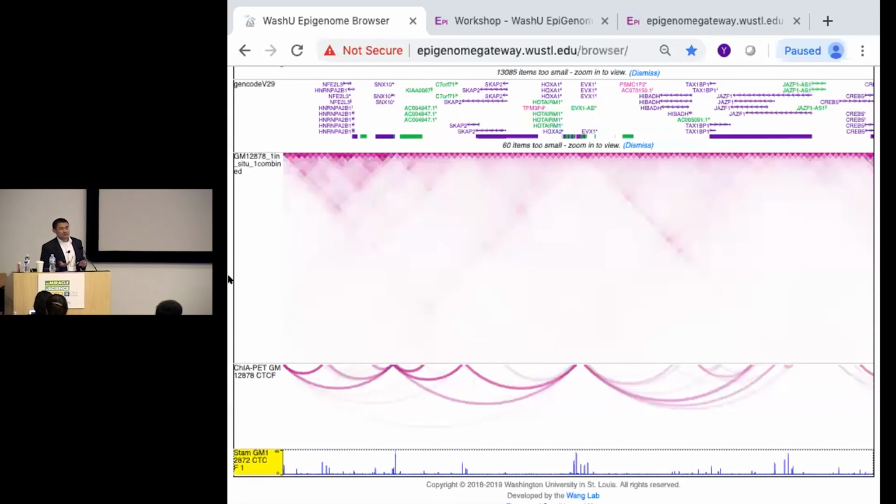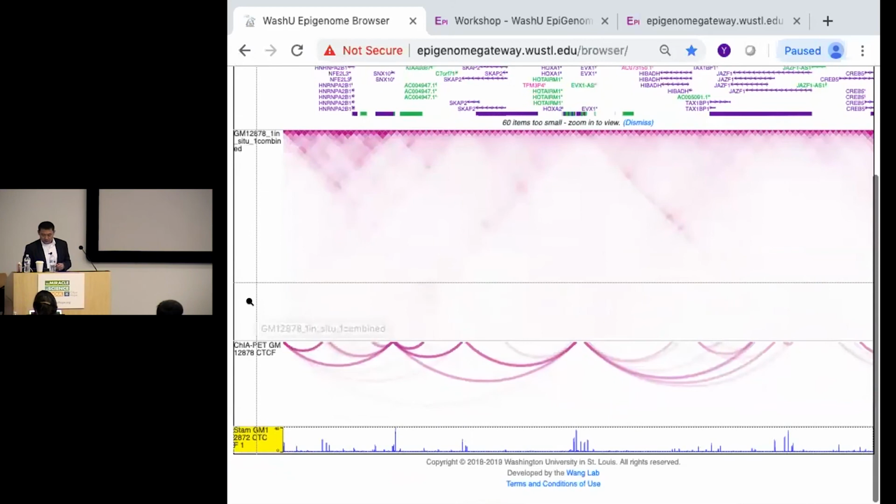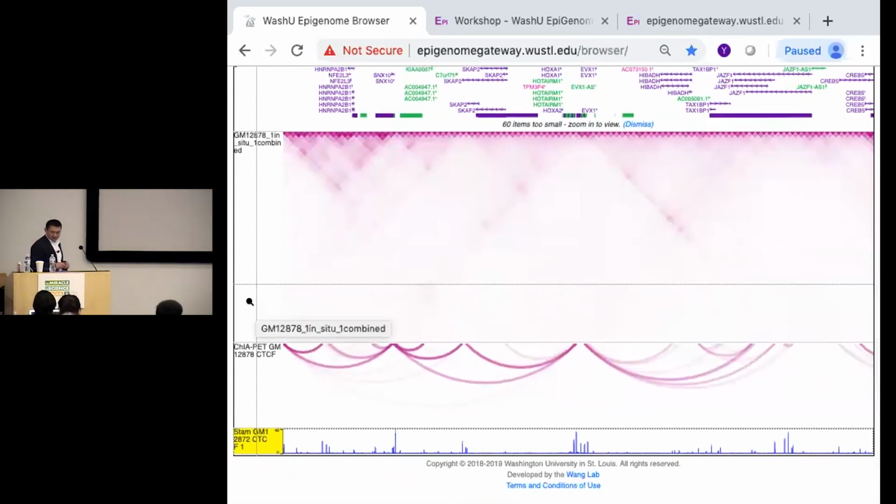Hi-C data is sometimes an art for you to find the right view. Use the right normalization, right resolution, and density contrast. But because we have a whole lot of other data that can be used to decorate and support this evidence, the beauty of this browser at this point, you probably see, is you can just continue to add, right? You can just continue to add on top.